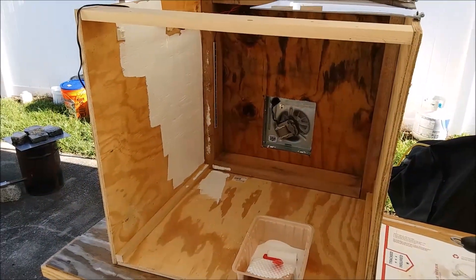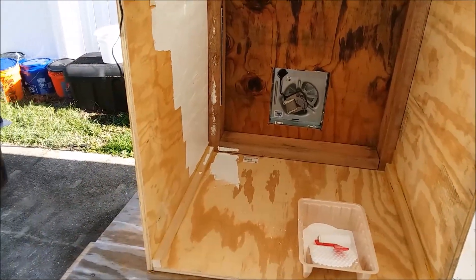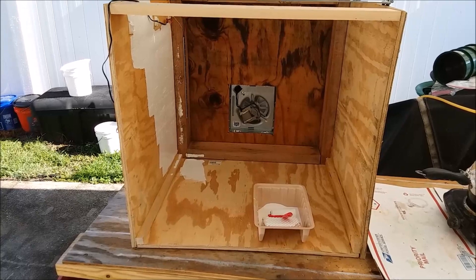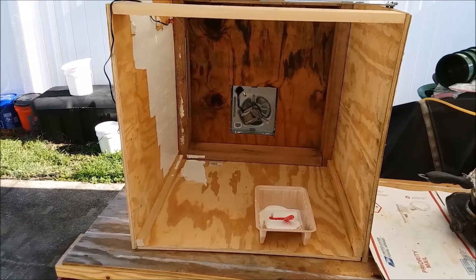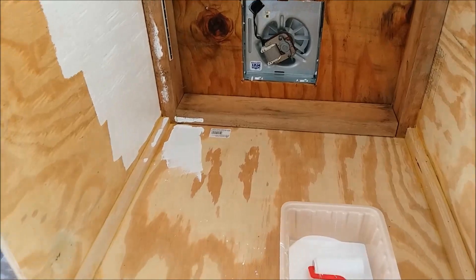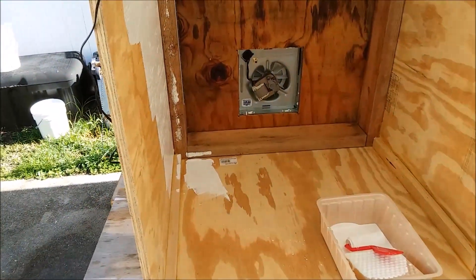Fume hood progress report: I've got the doors on it and I'm painting the inside white. This is both for protecting the wood from splashes of nasty chemicals and to improve visibility inside — it's pretty dark in there. I have some LED strip lighting installed over here and a couple strips up there. It's pretty bright, but the dark interior was soaking up the light, so painting it white should let the light bounce around and illuminate things better.